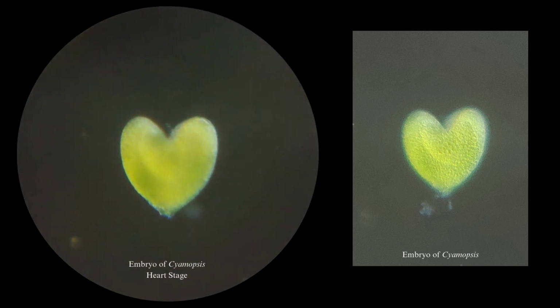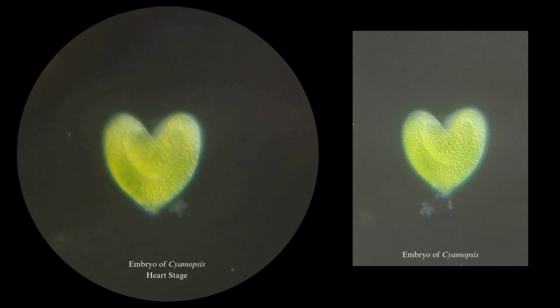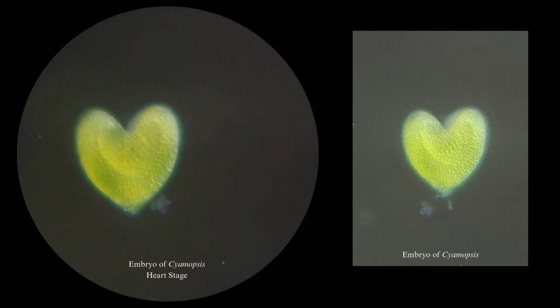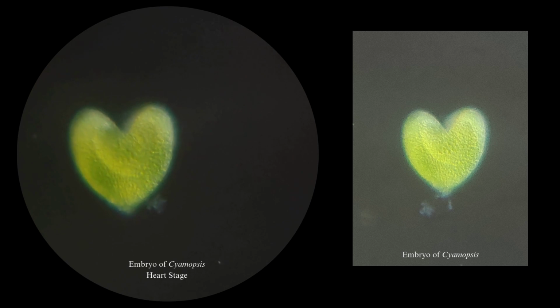Here you can see the heart-shaped embryo, which is developed from the globular embryo, where cotyledons arise from the embryo proper, forming the heart stage. Cotyledons are embryonic leaf-like structures that function in food storage, food absorption, and photosynthesis.